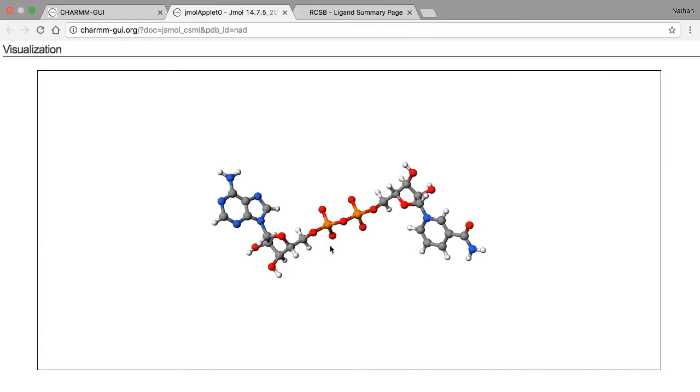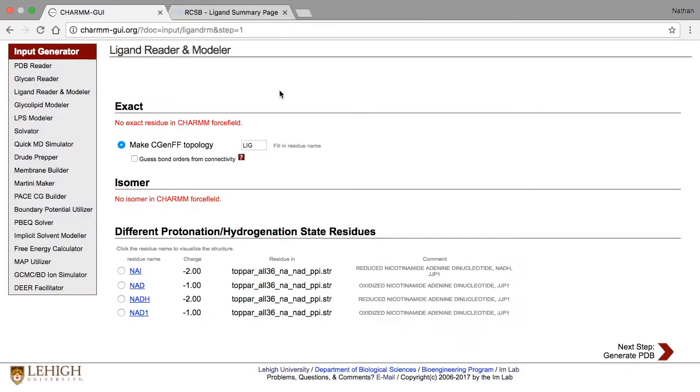We can select one of the oxidized NAD molecules, or we can try generating the structure we downloaded using the CHARMM general force fields. Most likely, you'll want to use one of the versions in the CHARMM topology. The reason is that the version in the CHARMM topology corresponds to the form of NAD that is most common at physiologic pH.